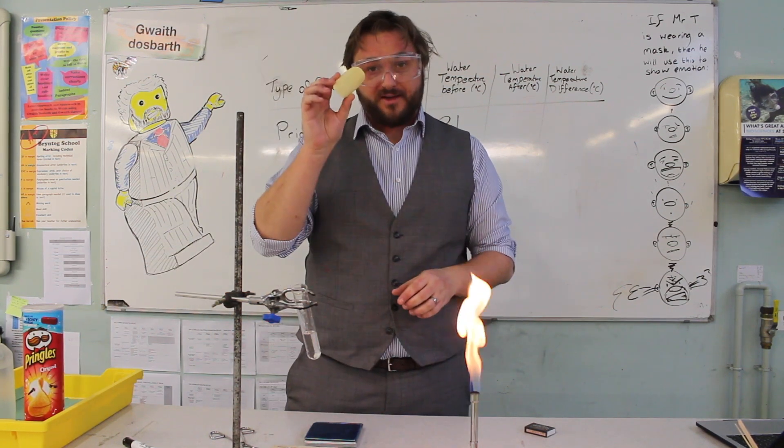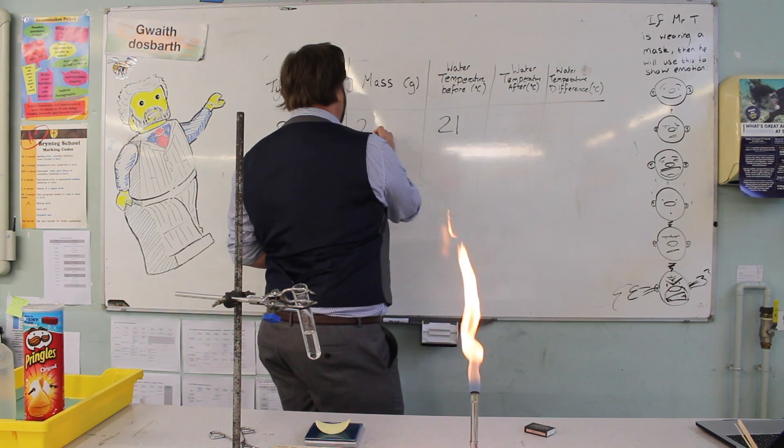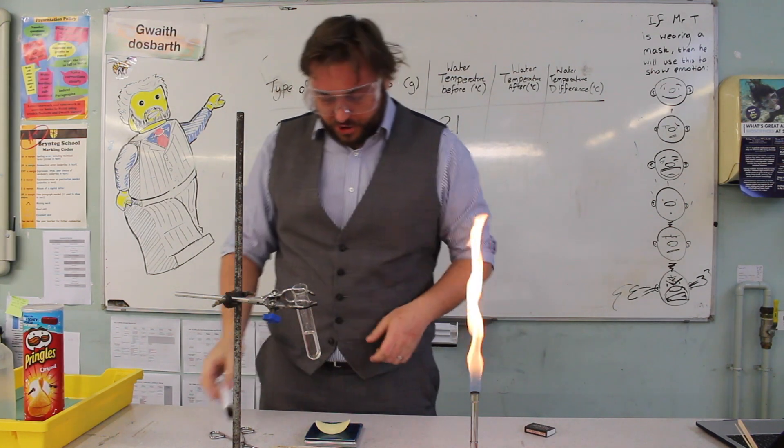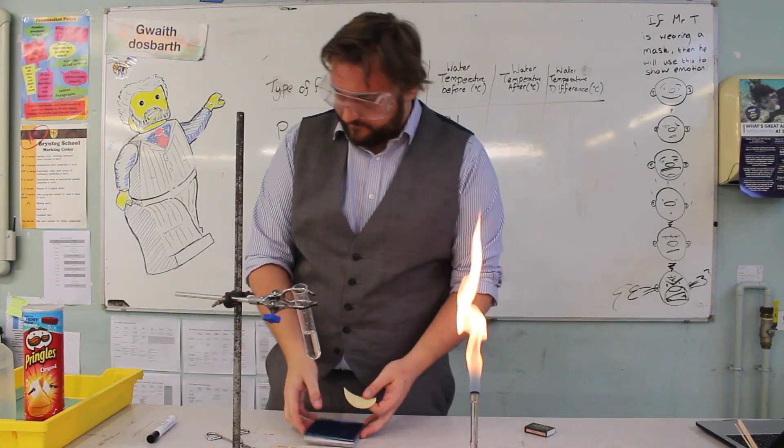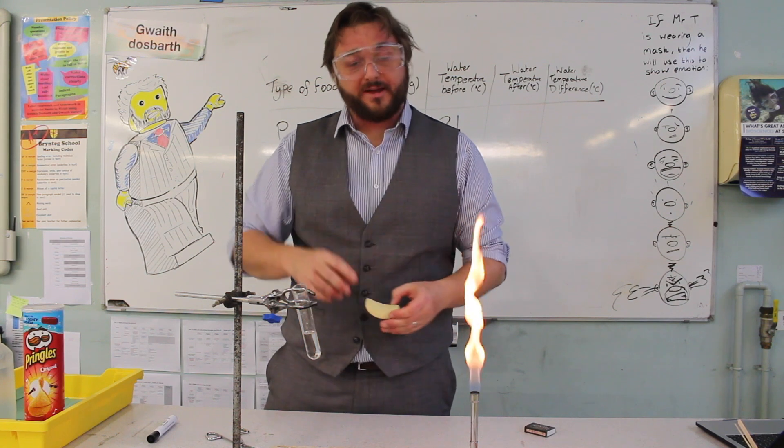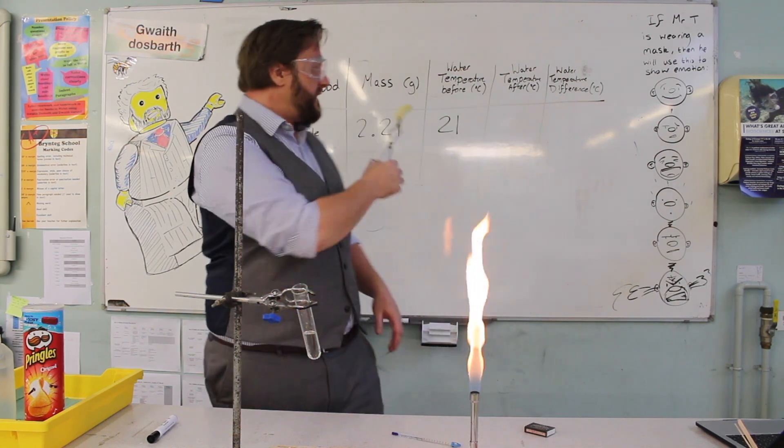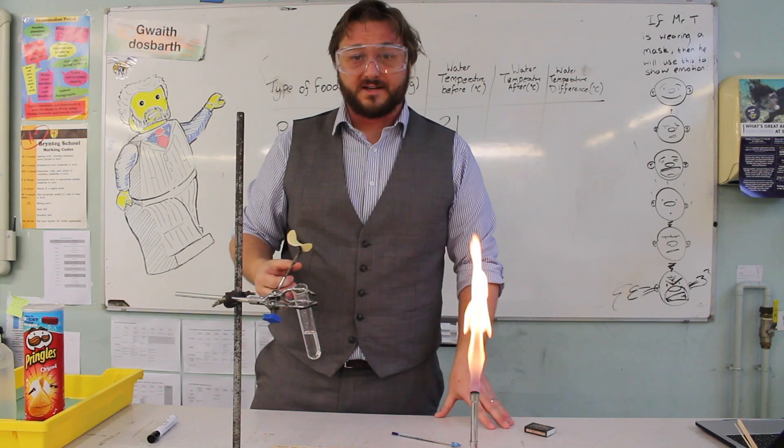You want to measure the mass of your crisp. And my crisp is 2.21 grams. Again, that'll be important later and I'll explain at the end. Once you've taken the mass of the crisp and the starting temperature of the water, you have your equipment set up.